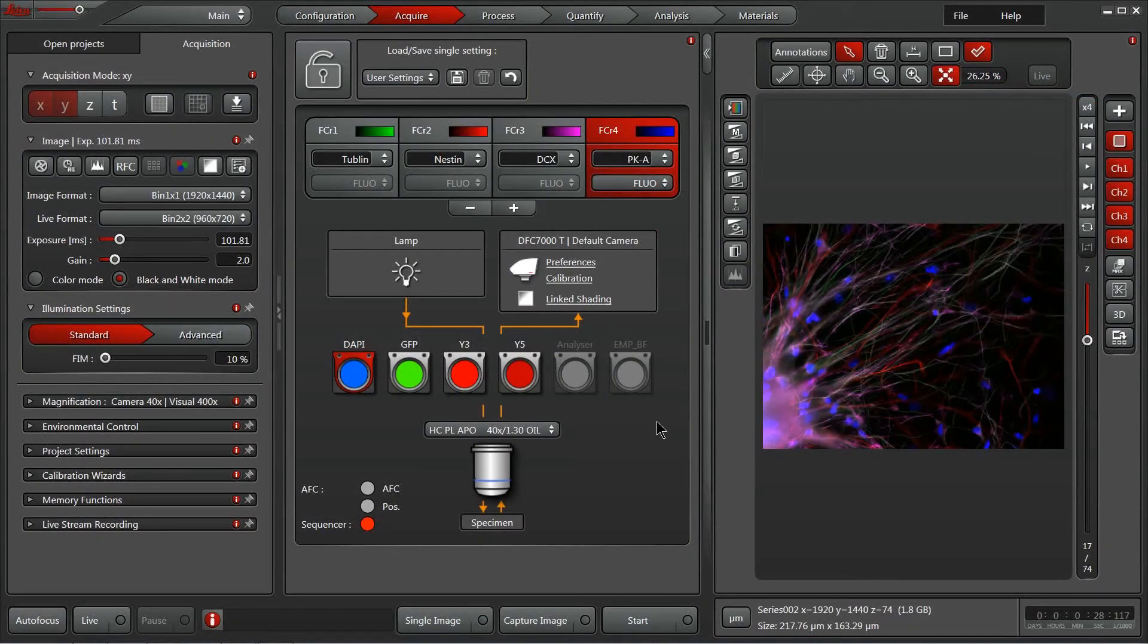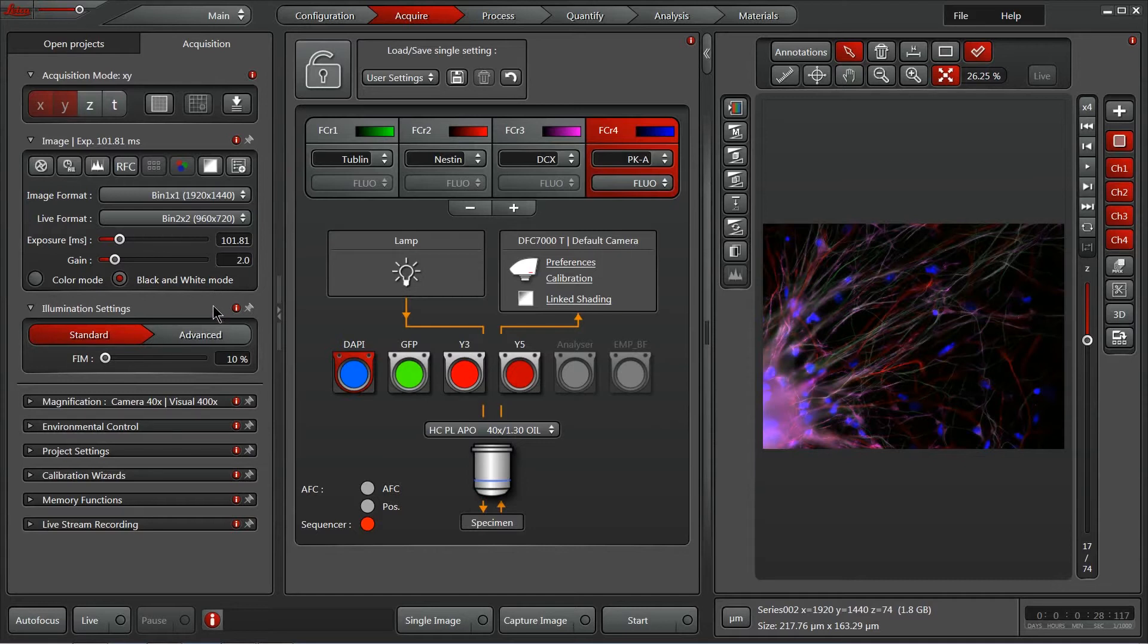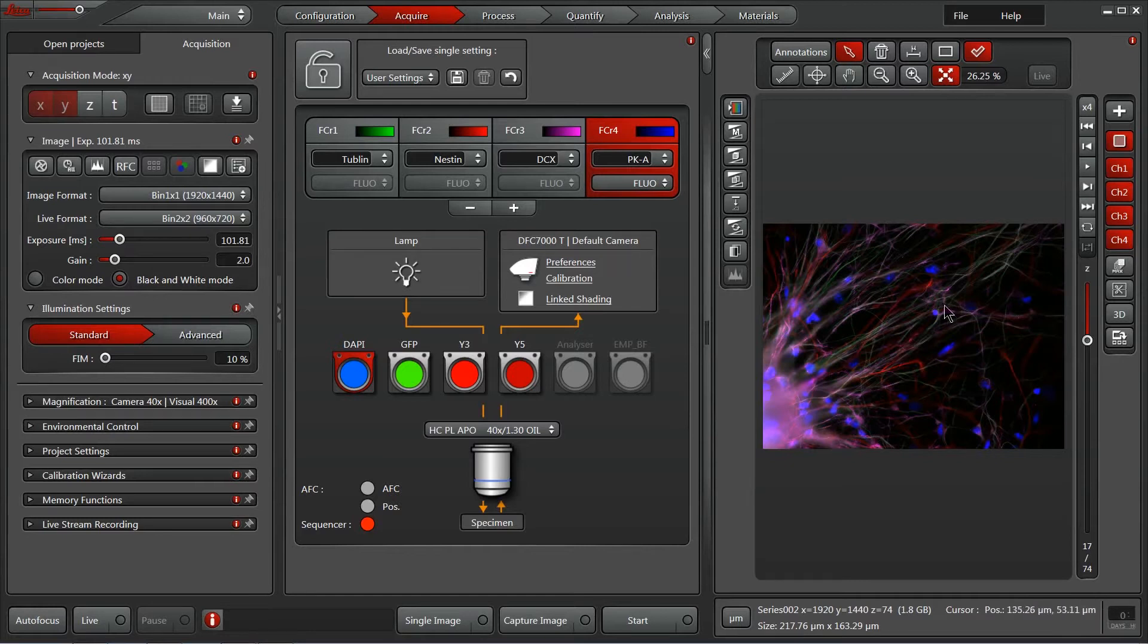Now let's take a deeper look at the Acquire tab here within the LASX software. Notice that it's broken into three distinct panels: the far left panel, the center panel, and this right image display panel.